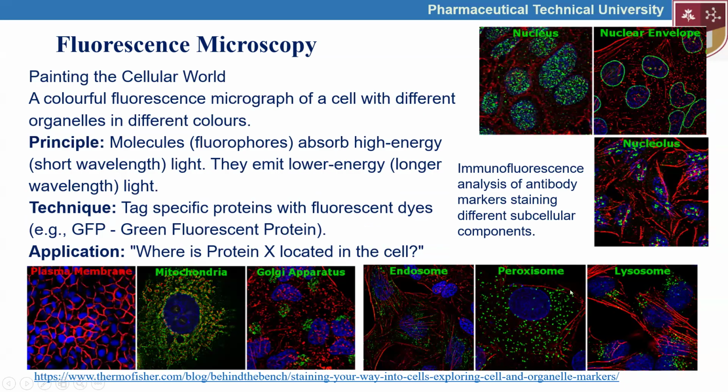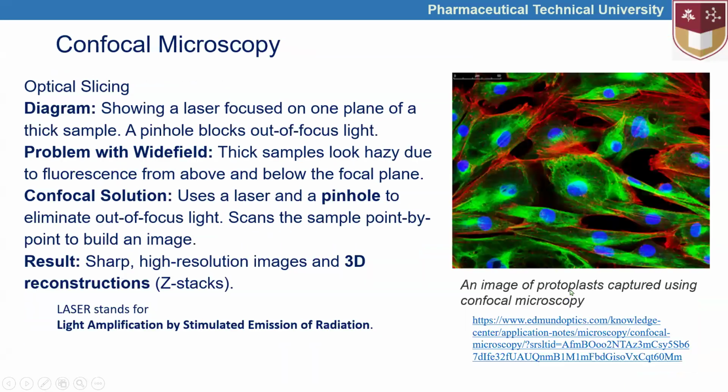This is about 2D structures. And here we can see 3D structures. The 3D structures tell more about the properties of cells, of microorganisms. So confocal microscopy can also be effectively used in research and in biomedical research.